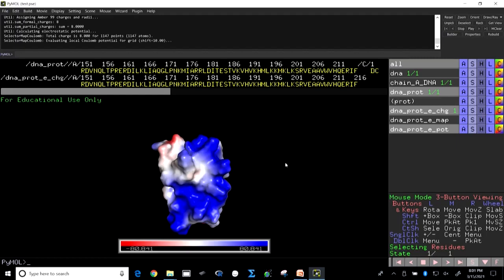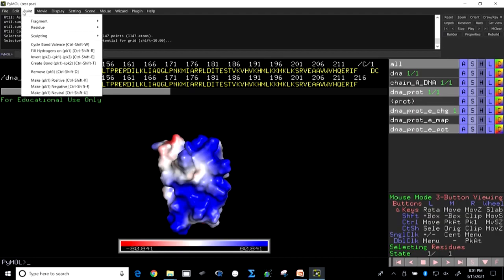To finish today's session, I have talked about the basics of PyMOL. You see the window, this is the window with menu where there are file, edit, build, movie, display, settings, scene, mouse, wizard, plugin and help. You could use a lot of all of them. There are a lot of options. The builder option, which is coming at a later stage, gives you the opportunity to modify.